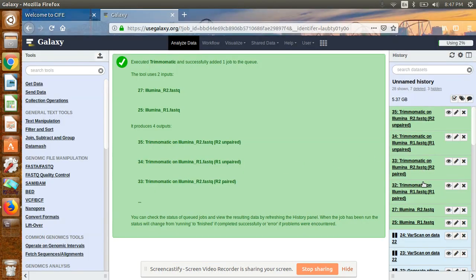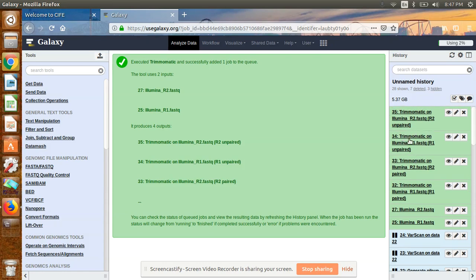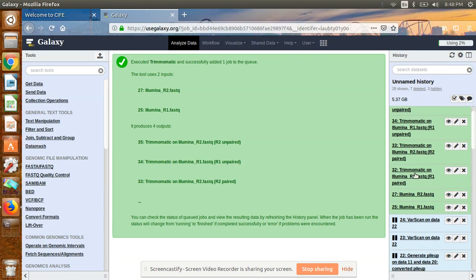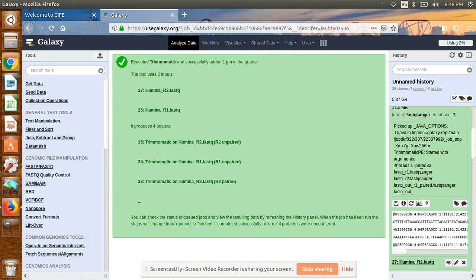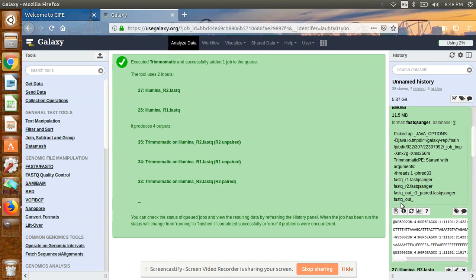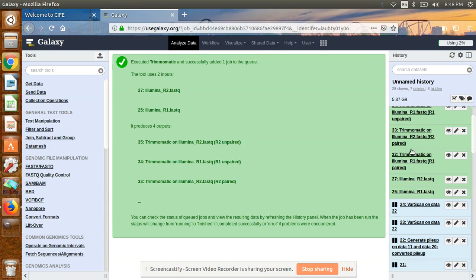After the run is completed you can see the completed output files — this is now trimmed data. You will have a forward trimmed file and a reverse trimmed file. Click here to view all the parameters you chose. After that you can download the trimmed data from here and save it to your PC. You will then have your trimmed data for both forward and reverse sequences.